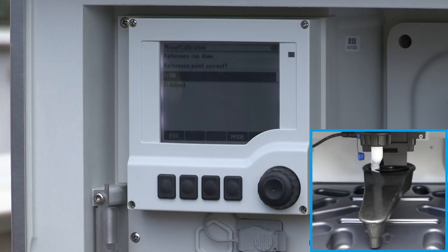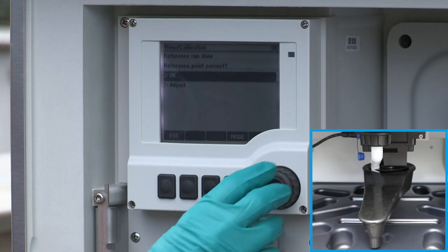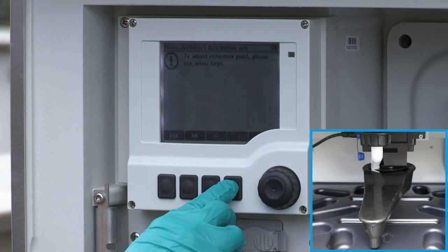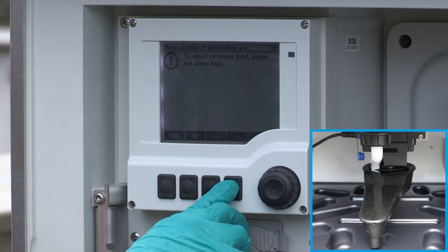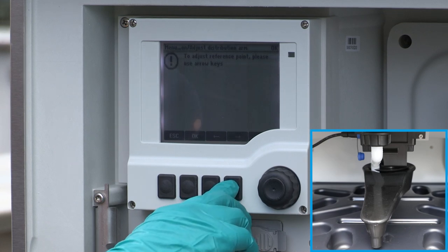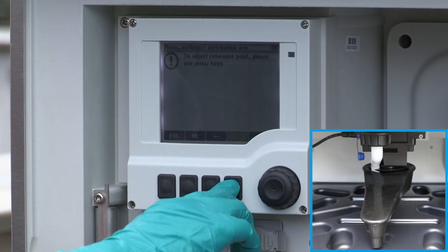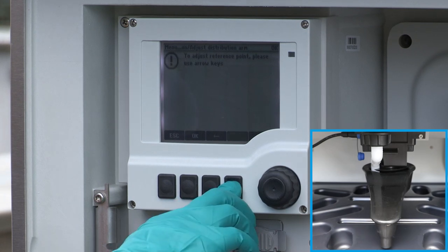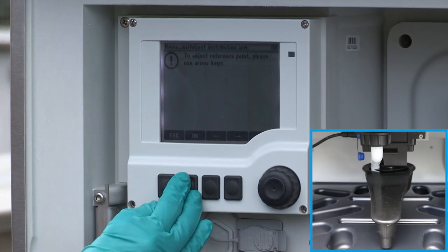If the reference point was reached, confirm directly with OK. If the reference point was not reached, first correct the position of the distribution arm by pressing the soft keys with the arrows. It might be necessary to press the soft keys several times. When the reference point is reached, confirm with OK.